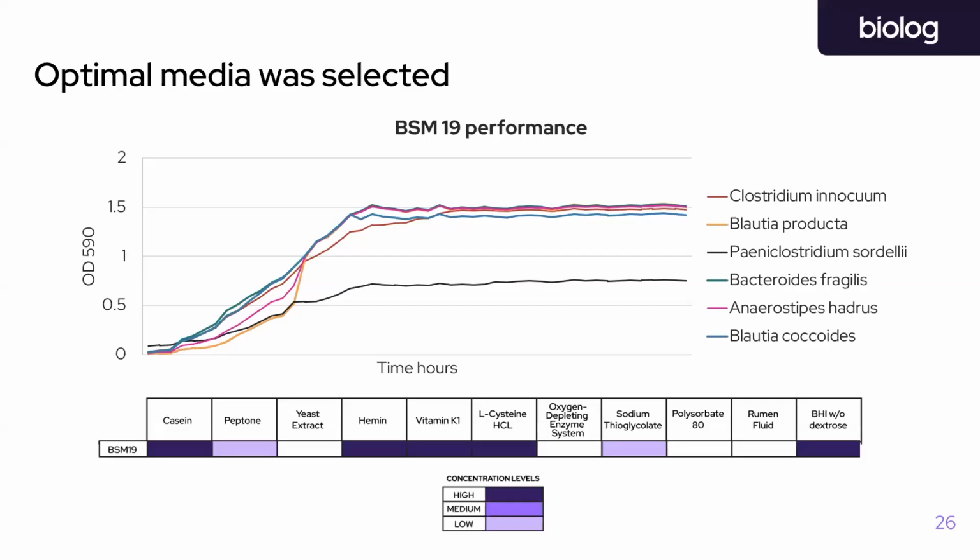So it depends on the scale of the experiment, really, what is needed. But with our protocols, you are able to take the plate outside of the chamber with a plate seal and place it into your Odin instrument for reads of up to 24 hours, which will be very similar to the results you would get from doing it within the chamber. And to that person who submitted it, Juan did mention that we have special anaerobic protocols available, so that's what he's discussing here.